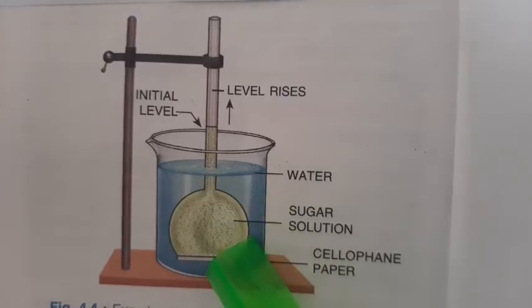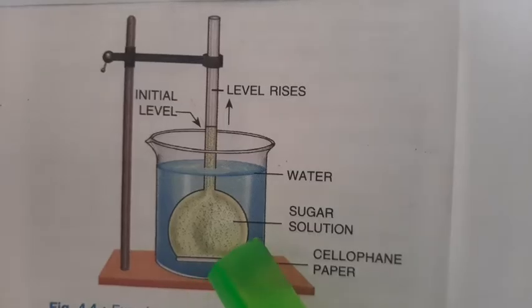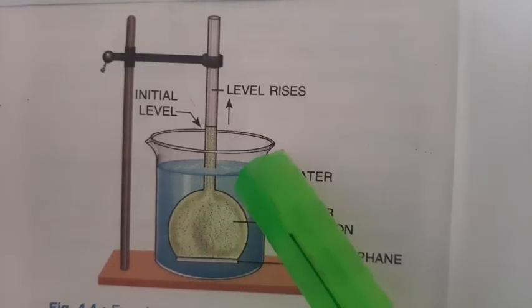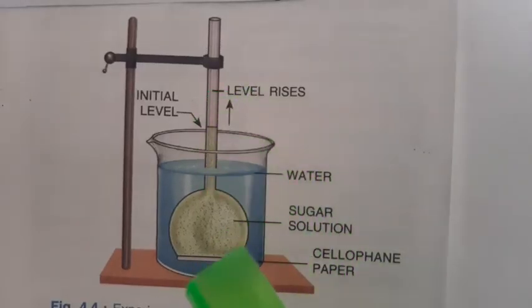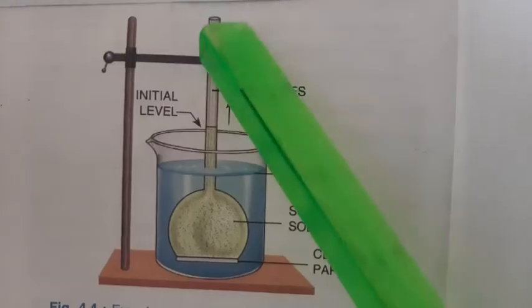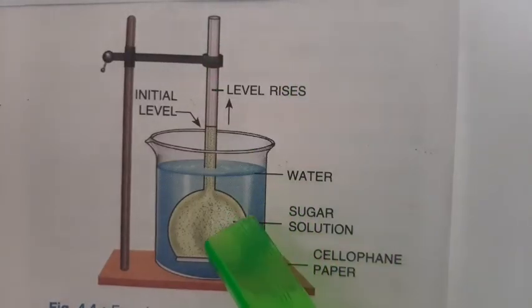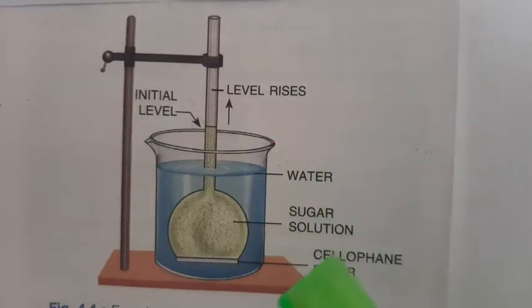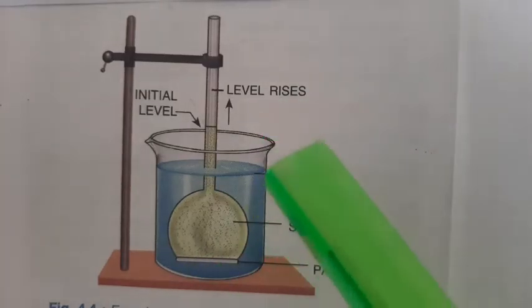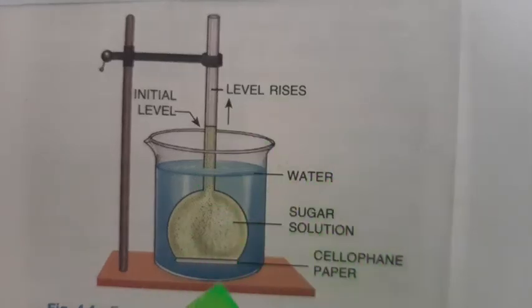Outside in the beaker there is plain water. Initially, the thistle funnel is filled halfway with a strong sugar solution. This thistle funnel is then inverted and placed inside the beaker where there is water. You can put the thistle funnel down first, and then add the plain water from outside.